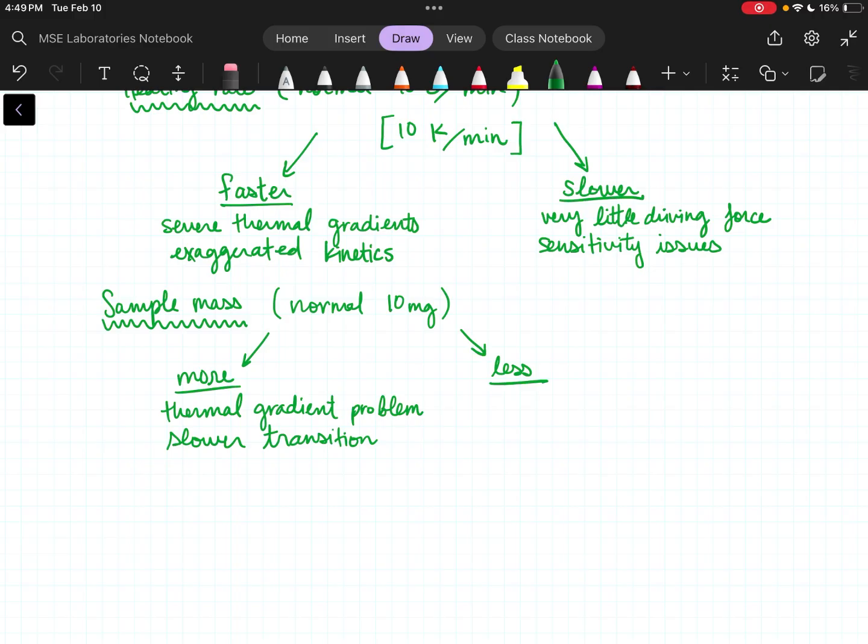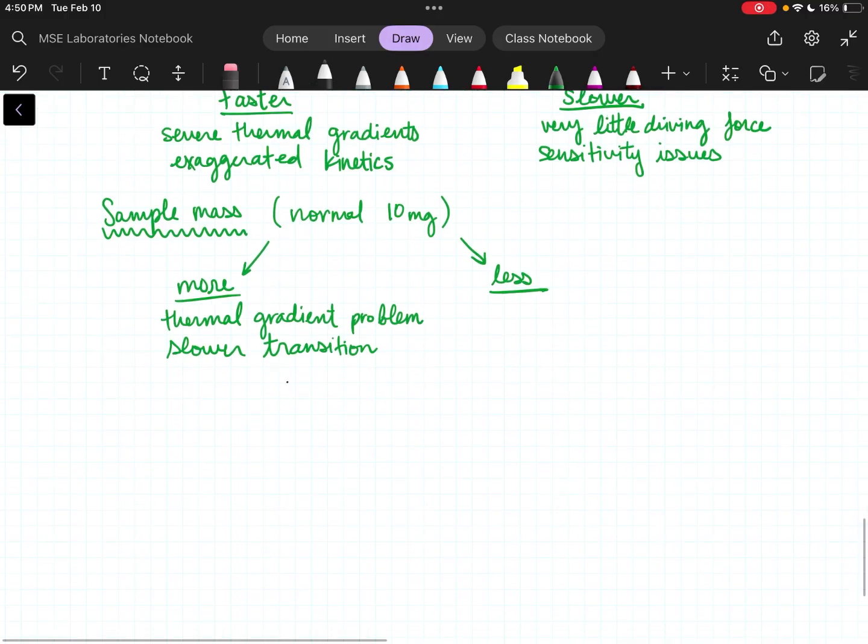Sometimes icebergs exist way above room temperature. Snowflakes, though, don't. It's just that quantity of thermal mass, and in this case it's cold mass, there isn't enough heat to be absorbed to really make that transition happen. So the transition is going to happen a lot slower, if you're thinking on our time scale.